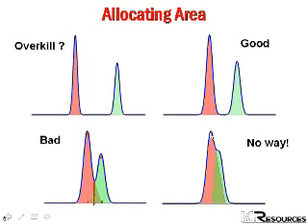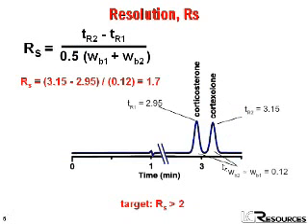And by the time we get to the example in the lower right corner here, we're not sure whether we have two separate peaks or whether we have a problem with a column. It's certainly going to be impossible to get accurate determinations of how much of each peak is there. So in order to get that separation, we usually want to measure that, and we've talked about that in an earlier session about how to measure resolution.